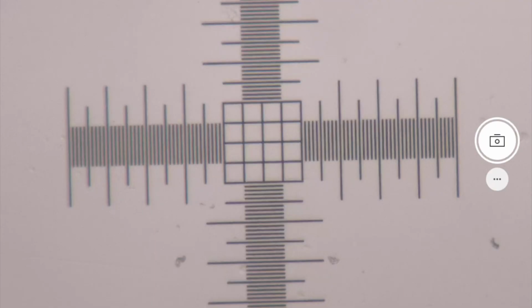All right, so now I'm going to walk you guys through setting up the Kohler illumination now that we kind of know all the parts and the pieces. So the first thing we're going to do, I like to put a reference slide down on the microscope at the desired focus level or zoom level. I have it on 10x right now. Yeah, and I like using the reference slide just because it can help me set the focus really well of the imaging and just gives me like a center to orient myself with.